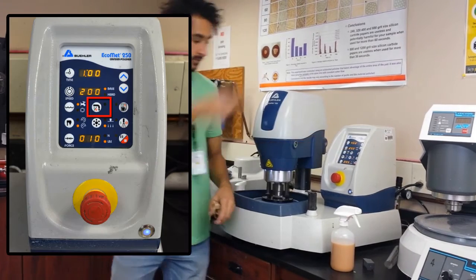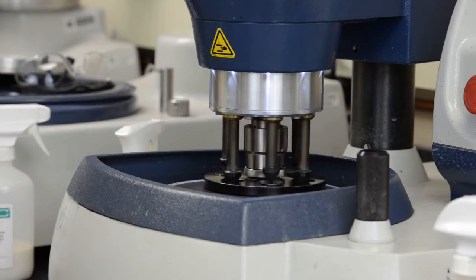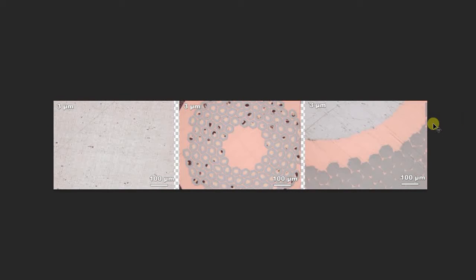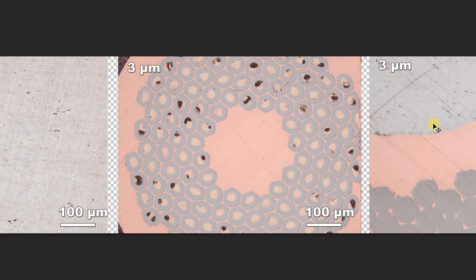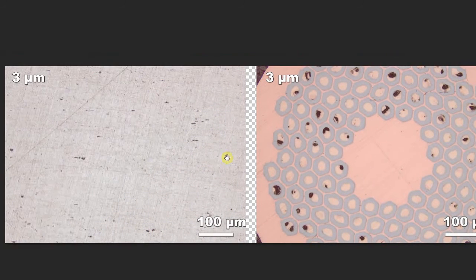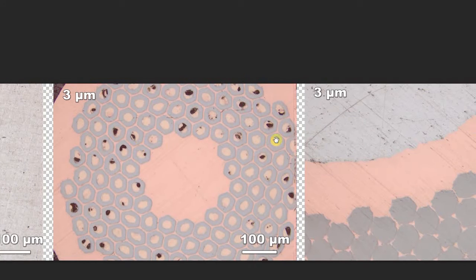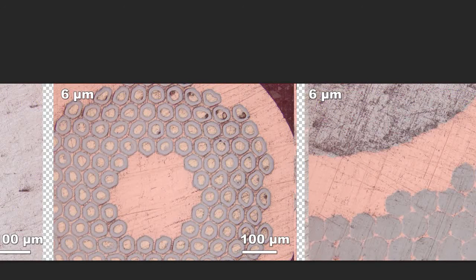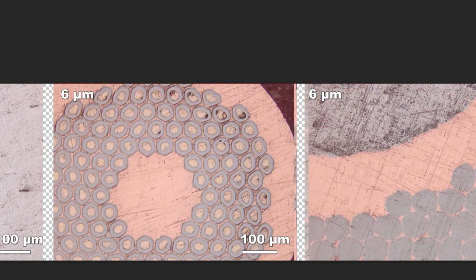You can use your hand to spread the suspension out. Make sure you cover the entire surface with a thin layer, but not too much. Same settings — press the buttons, put your samples in, and turn the water off. Now look at the difference — this is great! The samples are looking so much better. This is 3 micron — a major difference. The tin is now looking much better than the previous step. Compare: 6 micron versus 3 micron — huge improvement.